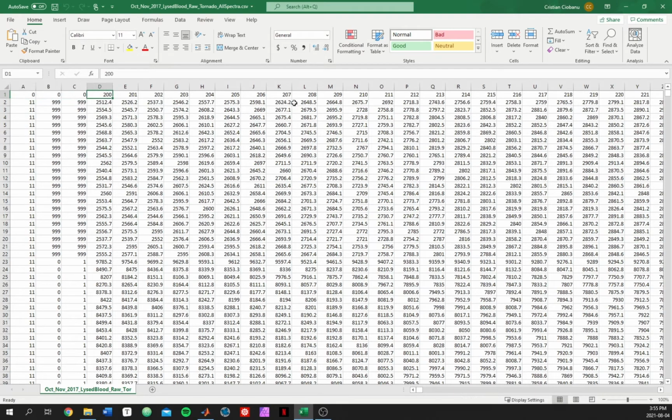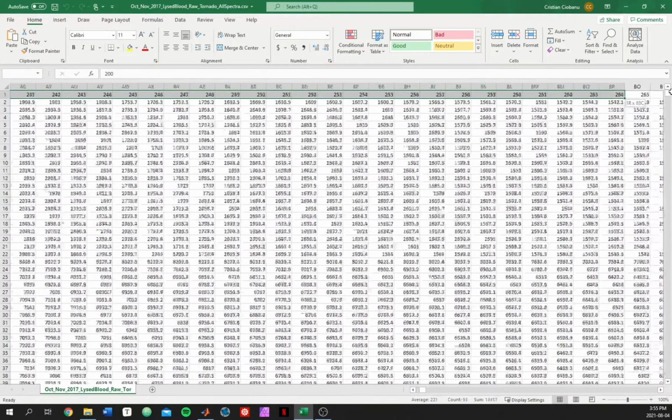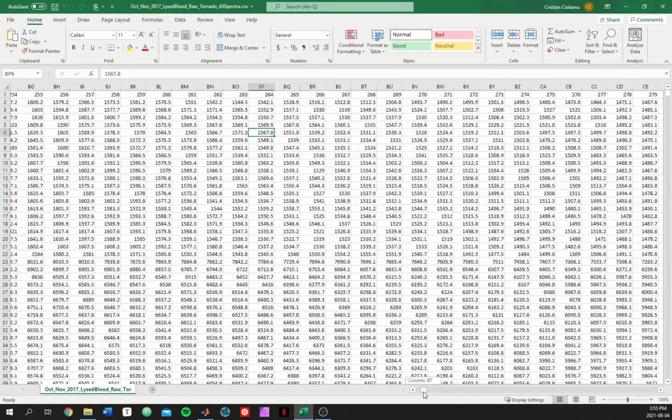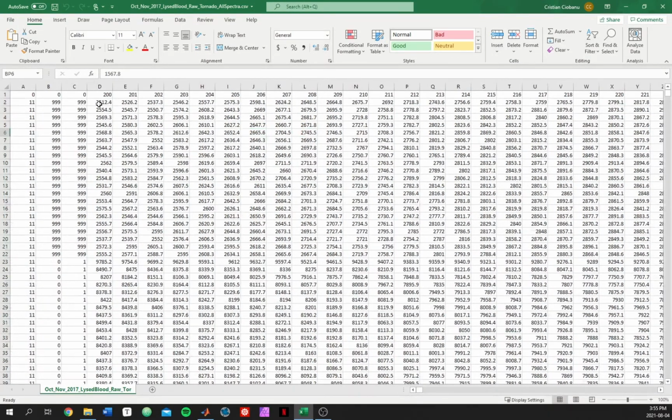Now finally, in this first row right here, we have the Raman shifts, disregarding these first 3 entries. So starting from here all the way to the end are all of the wave numbers, and under each wave number are the corresponding intensities. So if you're going to plot a Raman spectrum, you'll want to plot these values along a single row against the Raman shifts that are right above. And that'll give you a Raman spectrum with intensity on the y-axis and Raman shift on the x-axis.